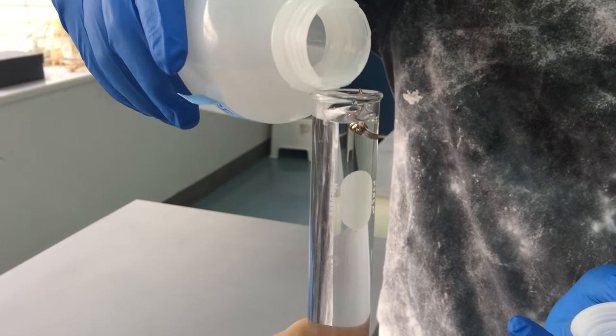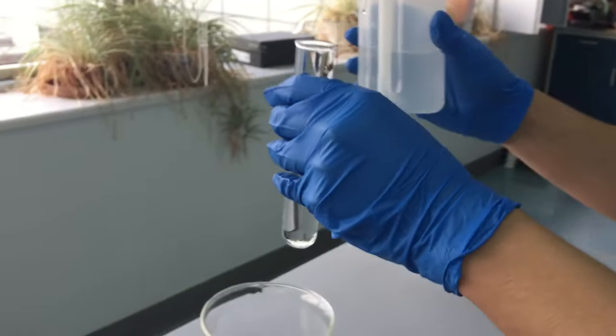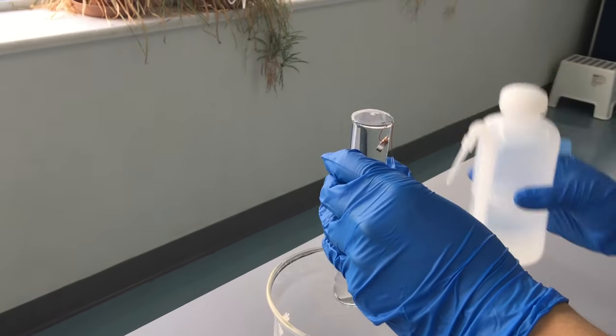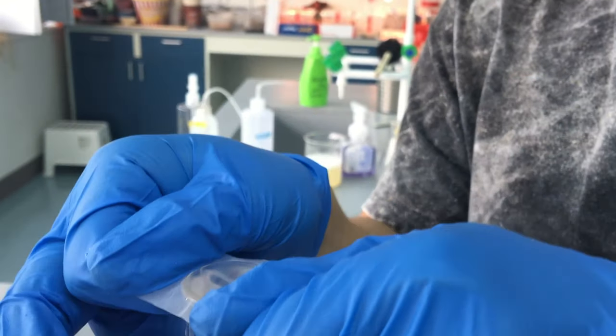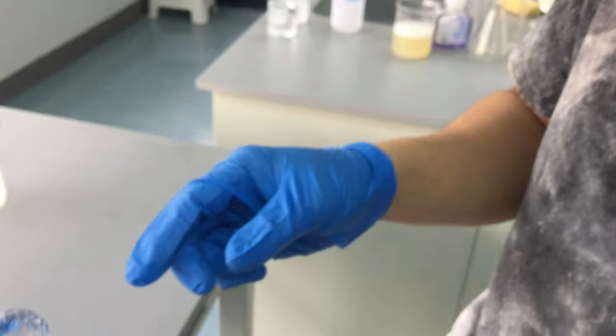Fill the test tube all the way with water. Seal the test tube with a piece of parafilm to keep the magnesium and water inside when you invert it into the hydrochloric acid.